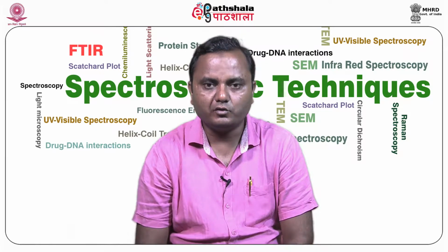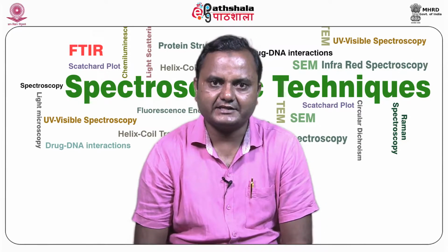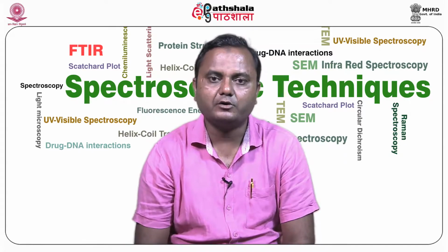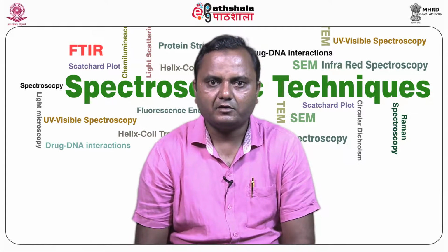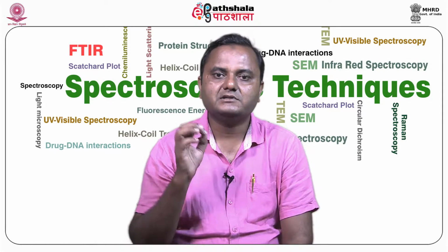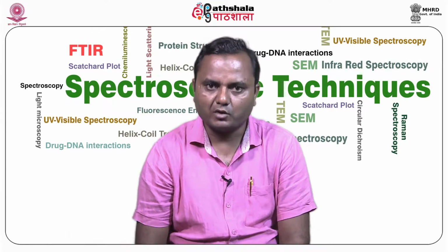The lower the molecular weight, the higher the concentration necessary. The sample solution must be completely transparent, that is, a non-turbid solution is required. The sample solution should not absorb light of the wavelength that is used for the scattering, and the molecules in solution should have a refractive index which is different from that of the solvent.